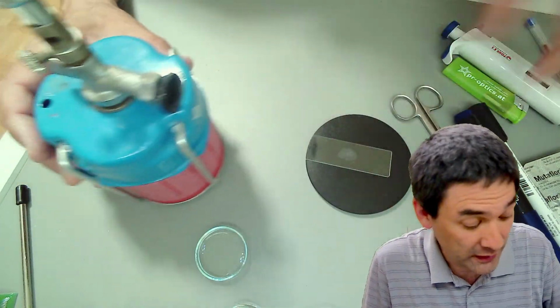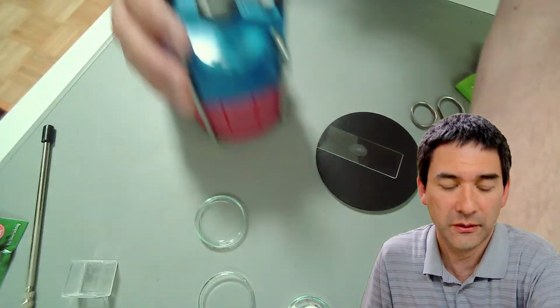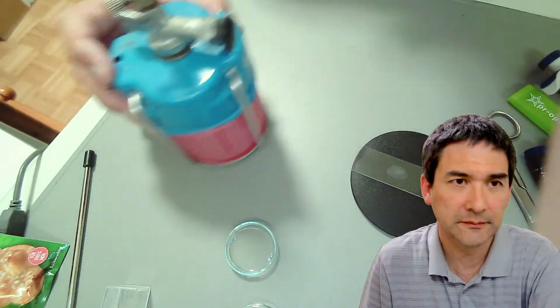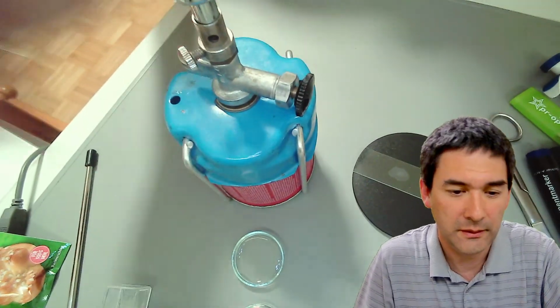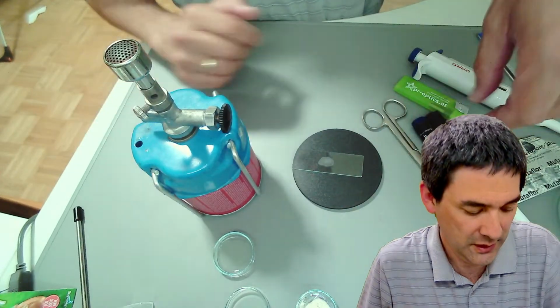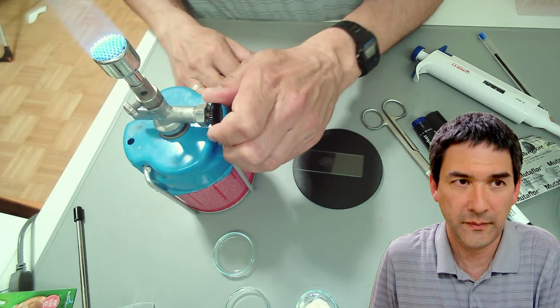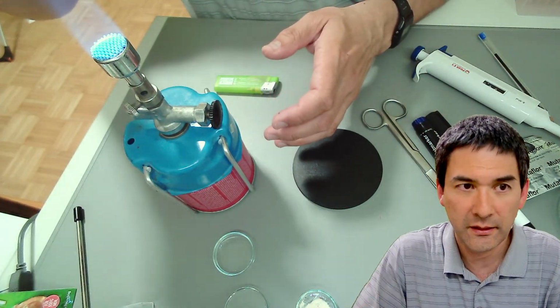So in order to do that, of course, I have to... Now maybe I'm going to do it like this. What's the best way of doing this? I have to maybe put it like this. I don't know. I have to be careful that I won't burn the... Okay, here we go. That's better. So in order to do that, I'm gonna pull the slide.